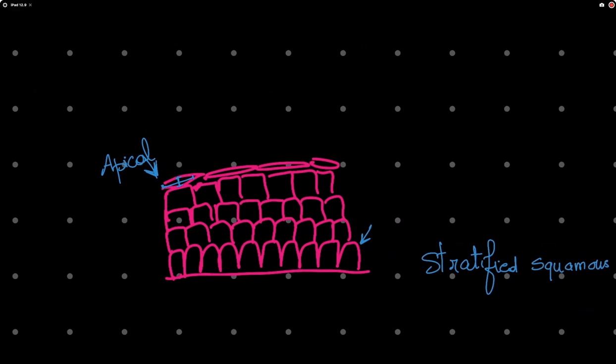What if I do have fibers here? A thick layer of fibers. Don't let this confuse you. Why? Because those are not cells to consider. You're going to see what is the last layer that still has nuclei in it, and this is going to be your apical cells. Although it's not the top layer in this tissue, it is the top cell layer. Is the difference clear?